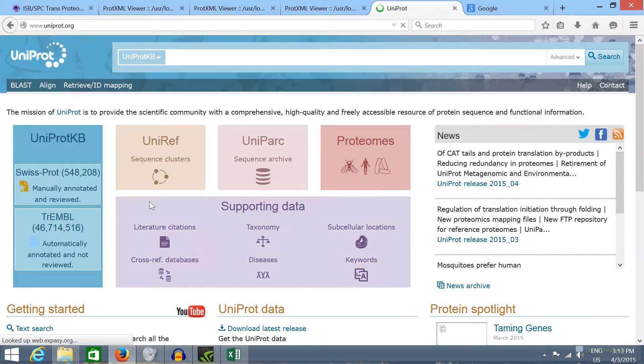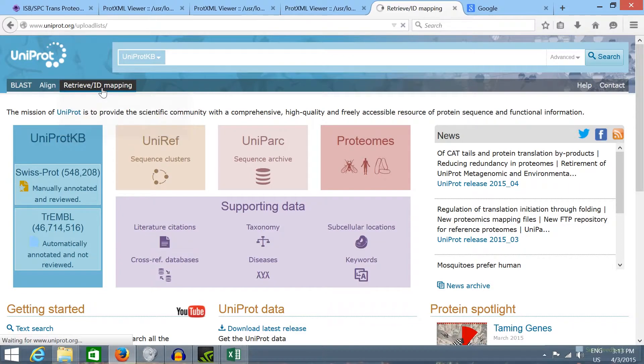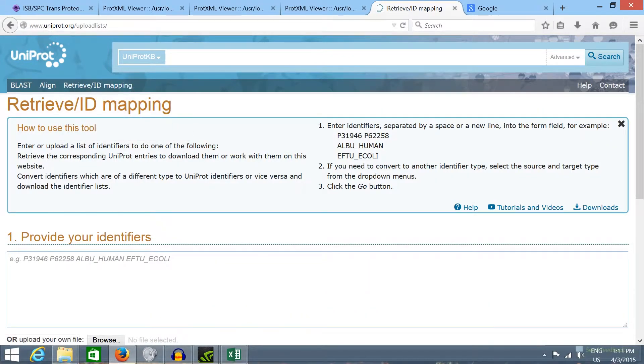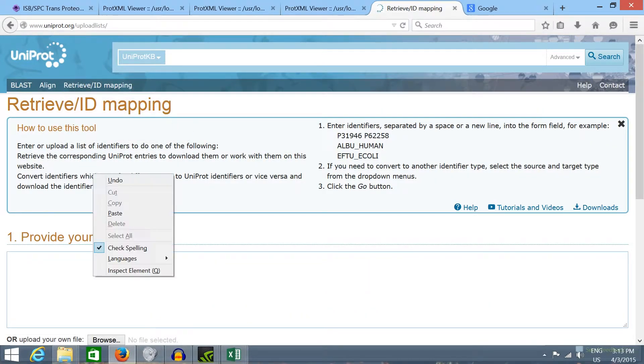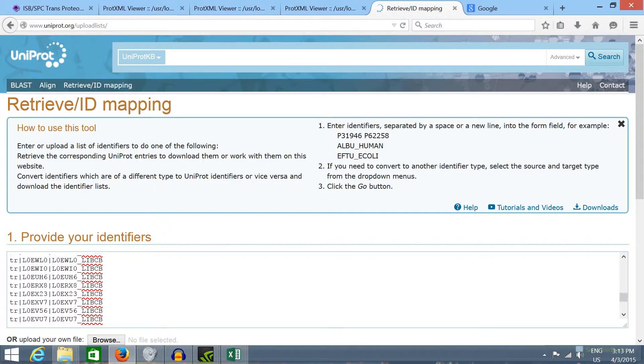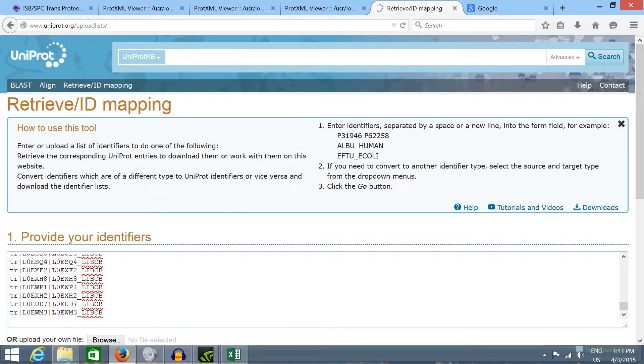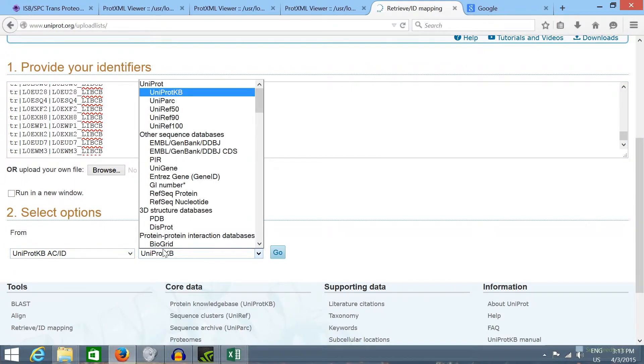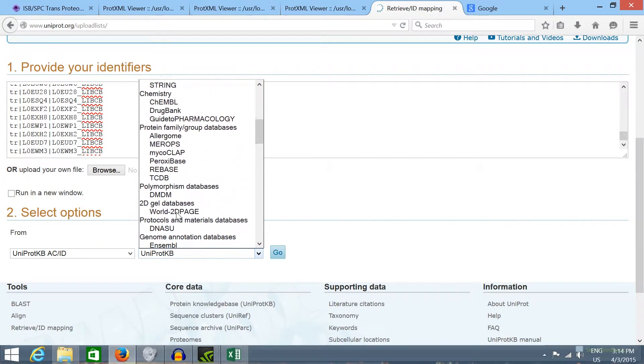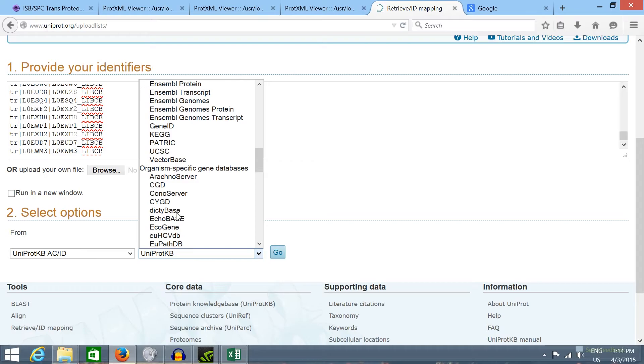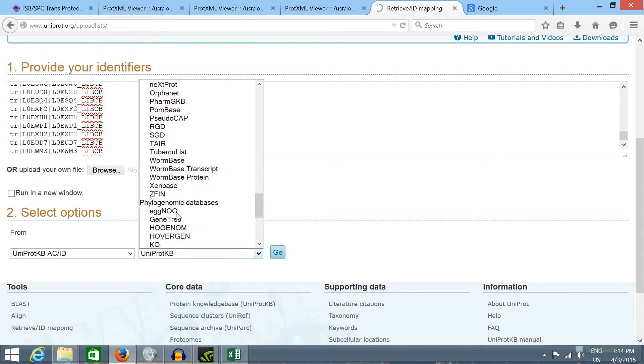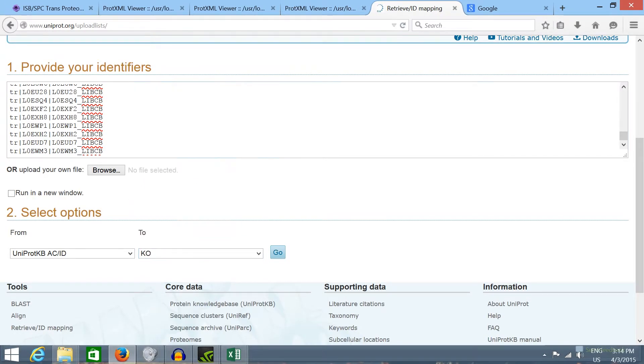We're going to click in the ID mapping tab and paste here those IDs that we have just copied. As input format I'm going to select the UniProt KB and as output format I'm going to select the KO format that consists of metabolic pathway IDs. Then we click here to map the IDs.